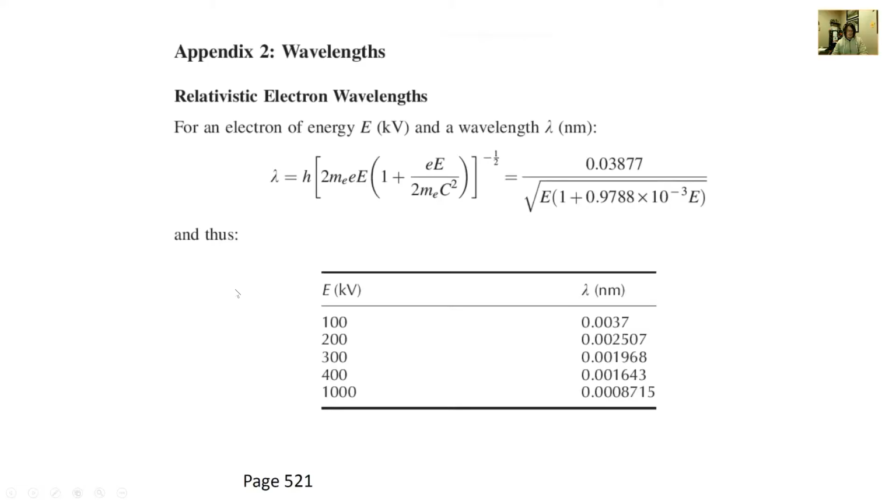Thank you. All right, so we see from our table that our approximation was a little bit off. Keep in mind, this is in nanometers, our approximations in wavelengths. So we're 0.001968 nanometers, which is 0.01968 angstroms. So in angstroms, we're a power of 10 in the other direction. And we assume 0.022, so a little bit off using the approximation, but that's not too bad.